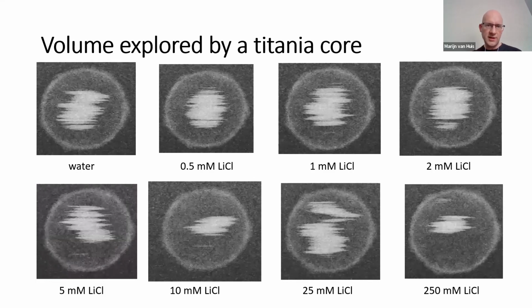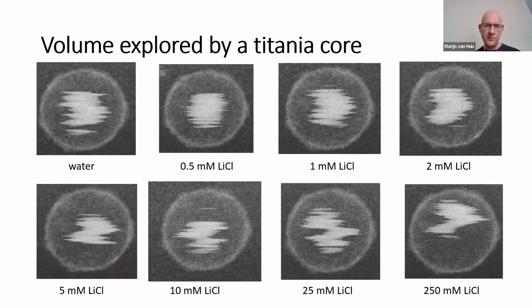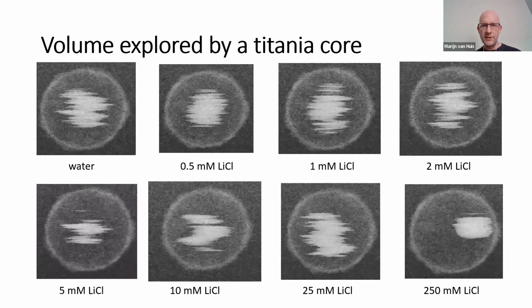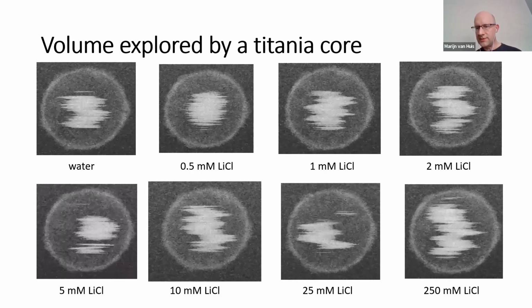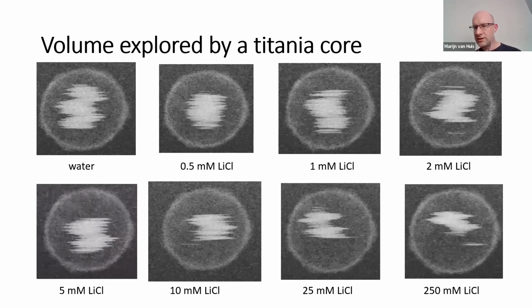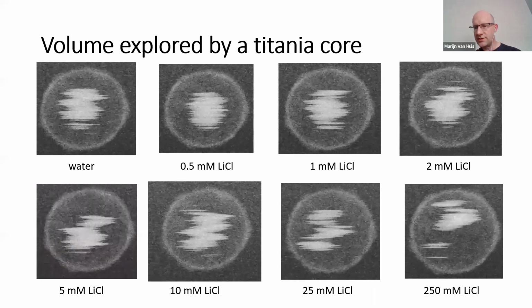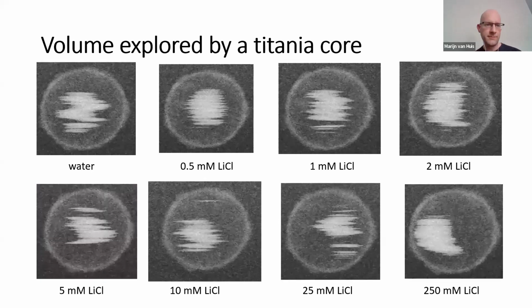The most extreme cases are the second one at 0.5 millimolar lithium chloride, where it's really confined more or less at the center of the shell, and at the bottom right at 250 millimolar lithium chloride, so the highest salt concentration. It is really as if it's bumping from side to side inside the cavity. So it can explore the full 3D volume.